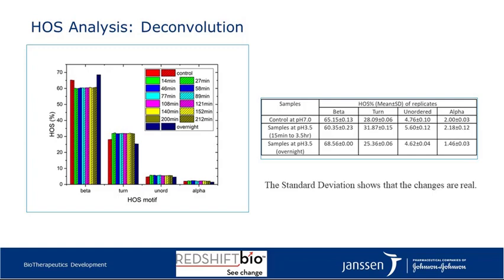All samples at the end of the experiment were clear and clean to the naked eye, so there was no obvious precipitation of sample over time. Likewise, when we look at the standard deviation on the data for each of the structures, it shows that the individual numbers do not overlap. Therefore, we believe that the changes are real and statistically different.